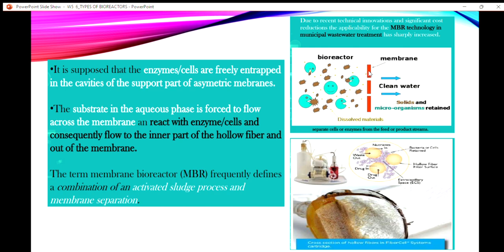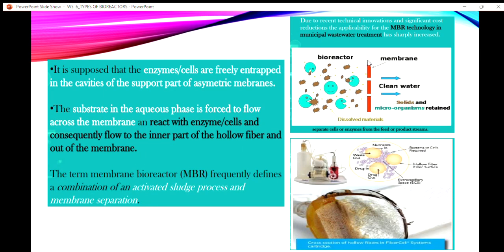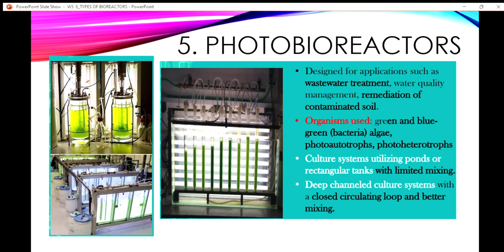If it is entrapped here, for example, bigger size material entrapped here, the flux, the flow distribution, is uneven and it becomes clogged here, so it will become thick here, so maybe water will not pass through. Okay, that is among the challenges. There are many more, I think you can read again and study further.